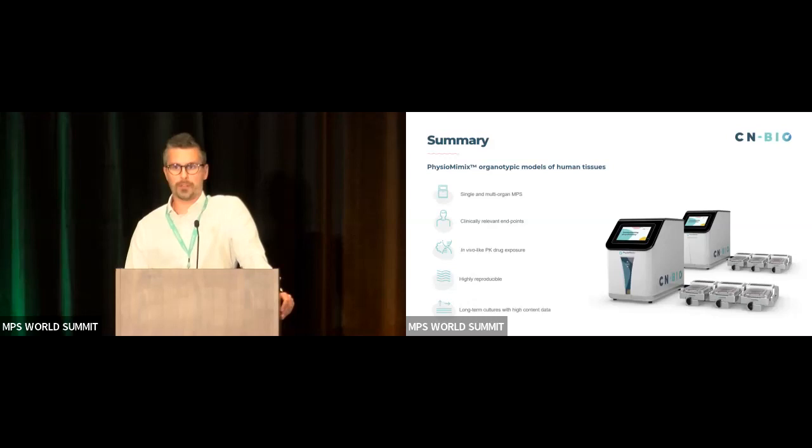The microtissues can be very consistently formed from different sources of cells to give you really high content data. It was just mentioned by one of the previous speakers. These systems are really high content. These are not really HTS screens. They need to complement or work alongside HTS screens to get the right set of preclinical data that you want to ultimately be successful.